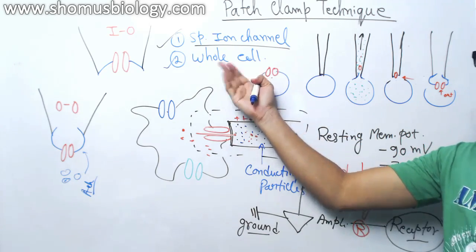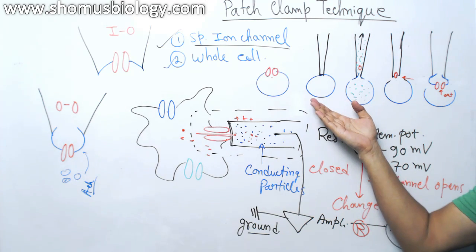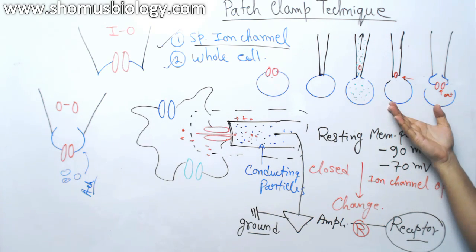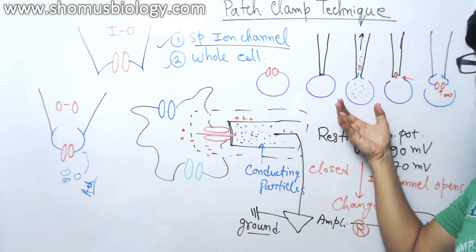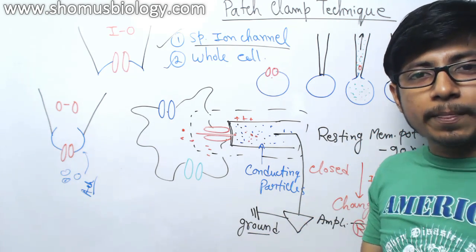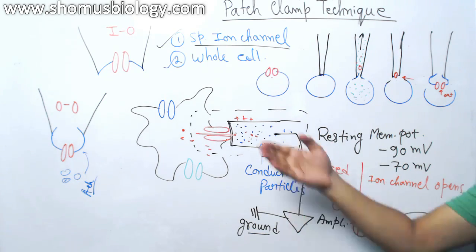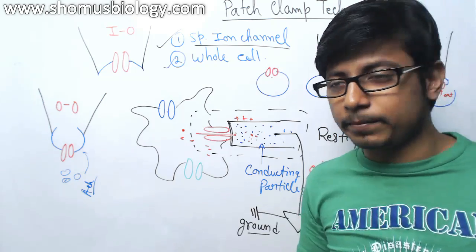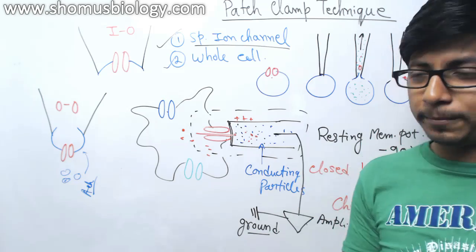So for understanding whole cell, we use the whole cell patch clamp technique. This is on cell, whole cell, inside out and outside out. Both inside out and outside out are required for understanding single channels. Whole cell patch clamp, or open cell, is also another process required to find out the whole cell function of ion channels, while the on cell clamp technique can be utilized to find out a single or a combination of ion channels' activity.